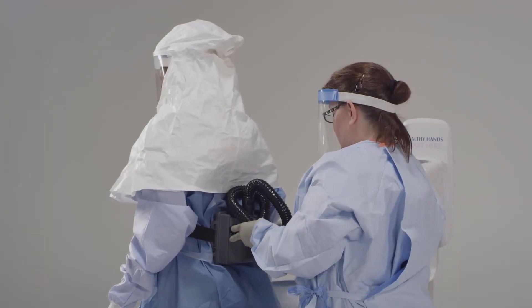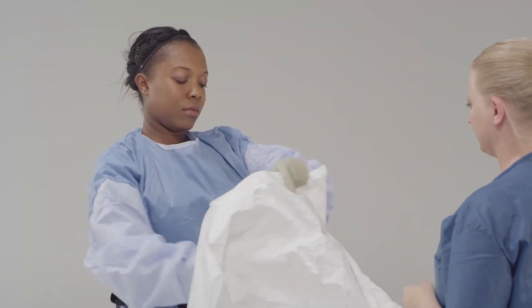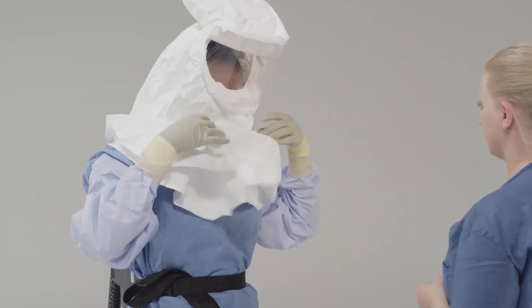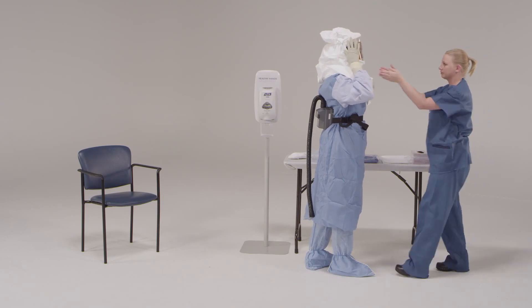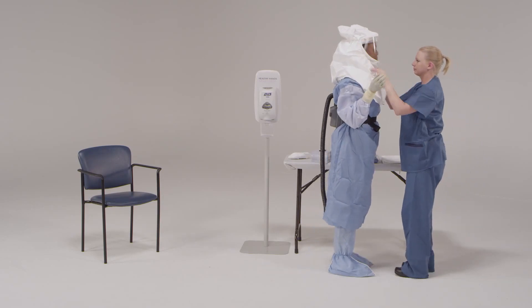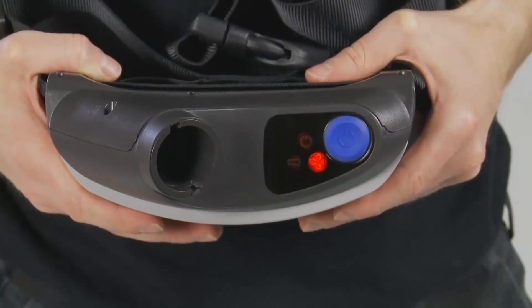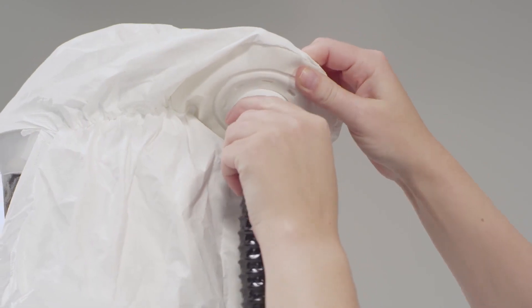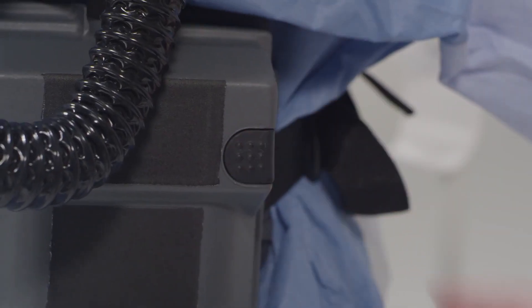Donning, or putting on, the PAPR and in-use procedures. Make sure that the fittings and connections are tight and the breathing tube is not leaking. Airflow should be adequate at 6 CFM. The PAPR is turned on before entering the exposure area. You should exit an area immediately if you notice that the airflow in the PAPR is interrupted or the equipment gives an alarm.